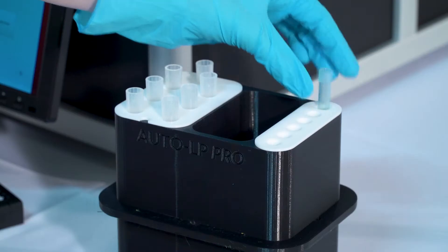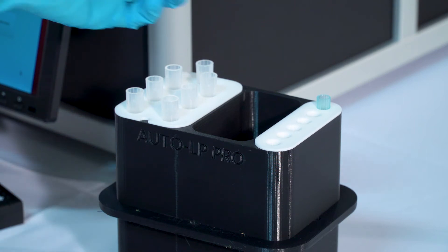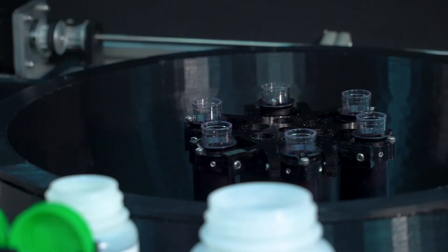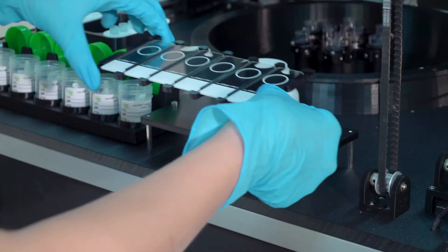It's simple to use. Populate the AutoLP Pro with pipettes, centrifuge tubes, working tubes, and microscope slides.